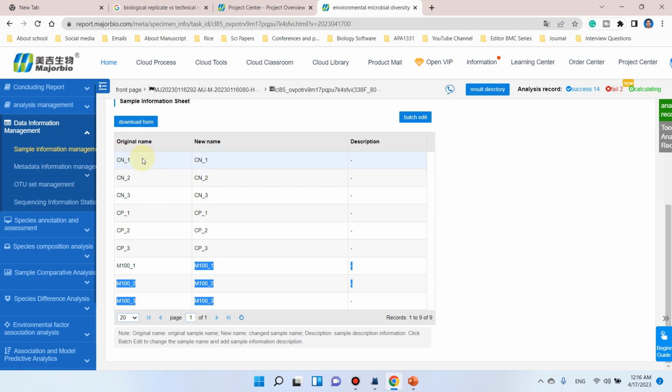Actually in this design, we have applied one disease. In this control negative, we did not apply any disease because this is normal. And in this control positive, we have applied one disease. And here, to cure that disease, we have applied medicine, and we have just compared the microbiome diversity. In the follow-up one by one analysis of OTU, alpha and beta diversity, I will show you what our results are telling.